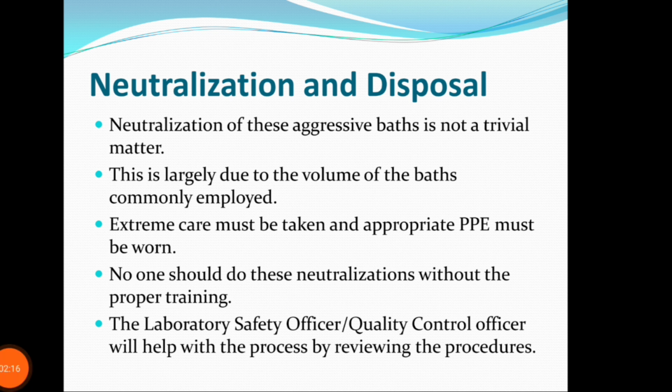Next, neutralization and disposal. Neutralization of these aggressive baths is not a trivial method. This is largely due to the volume of the bath. Extreme care must be taken and appropriate PPE must be worn. No one should do this neutralization without the proper training. The laboratory safety officers and quality control officers will help with the process of reviewing the procedure.